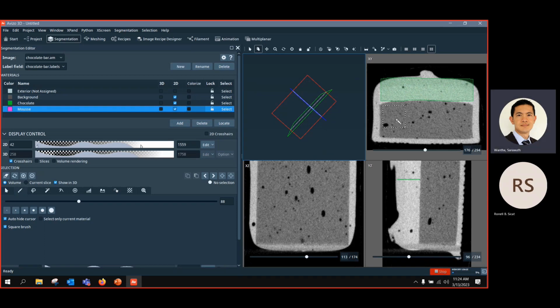Let's see, if I start to paint like this and go up to have overlapping into the first material like this, and if I assign this second material to the mousse, you will see that this overlap between two regions cannot be assigned to two materials because I have only one voxel, one material. So if I assign this to the mousse, you will see what's going to happen.